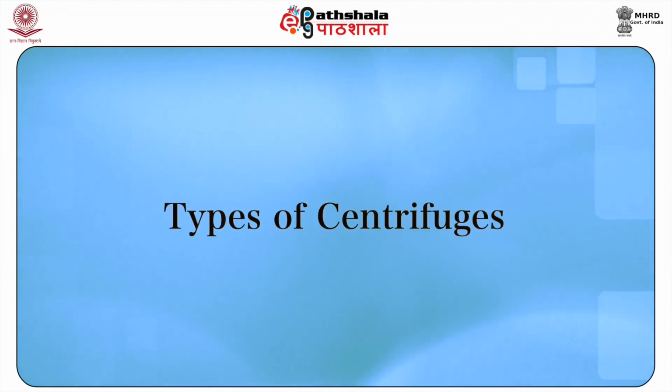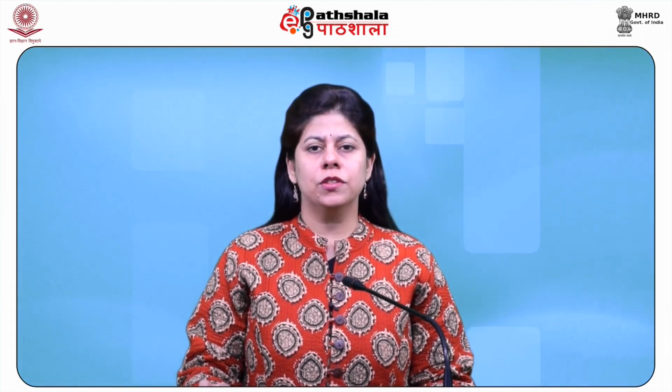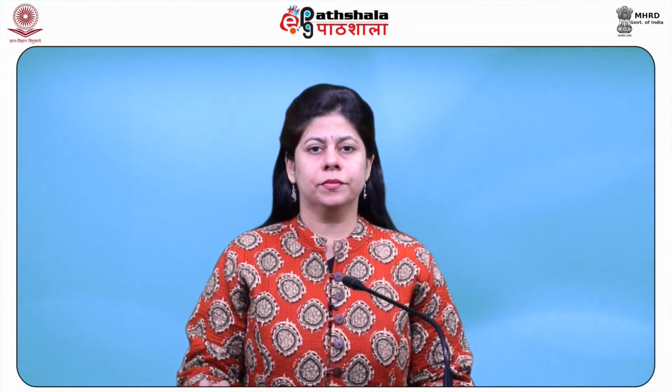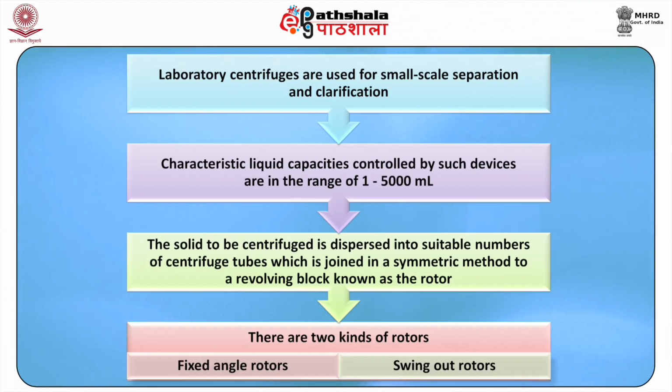Types of centrifuges. Broadly, centrifuges are classified into two categories: laboratory centrifugation and preparative centrifugation. Laboratory centrifugation. They are used for small scale separation and clarification. Characteristic liquid capacities handled by such devices are in the range of 1 to 5000 ml. The solid to be centrifuged is dispersed into suitable numbers of centrifuge tubes that appear as test tubes, which are joined in a symmetric manner to a revolving block known as rotor.